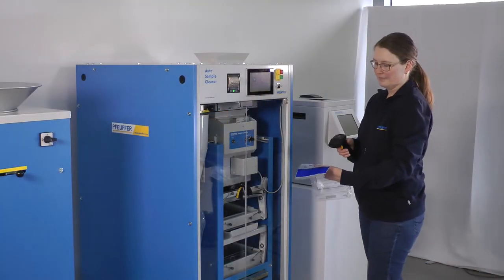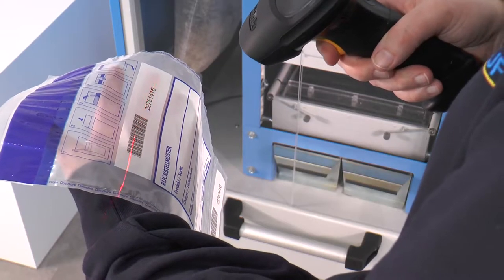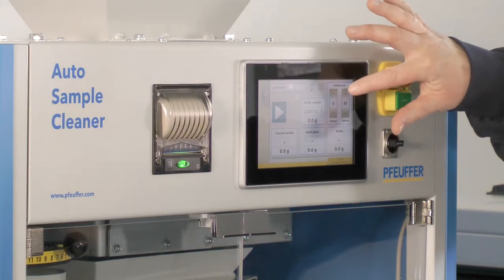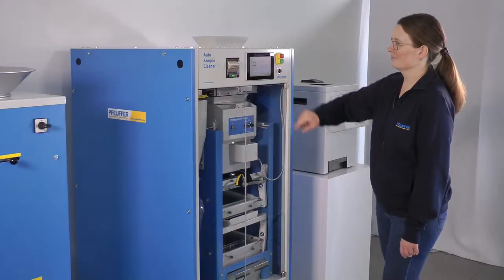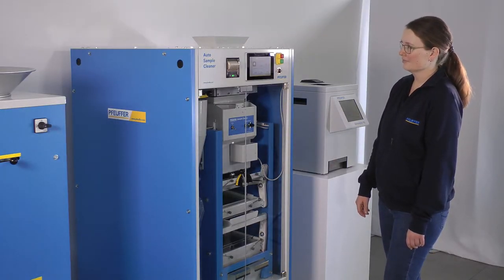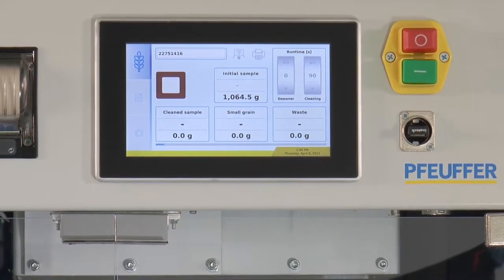Each sample can be clearly related to a barcode. The balances are tared.